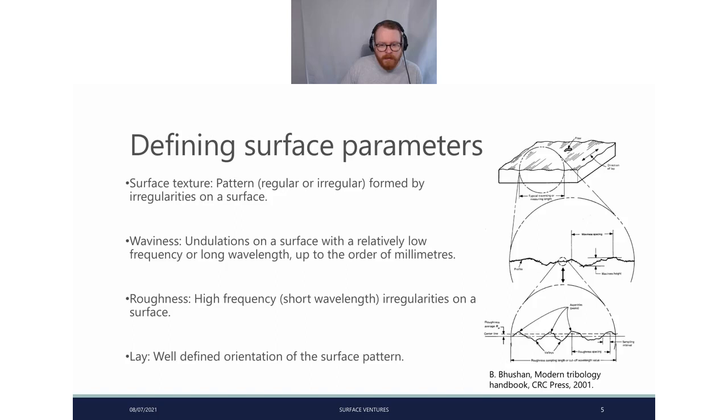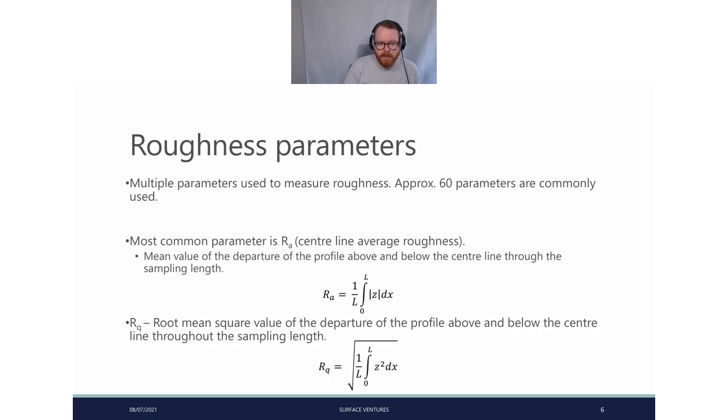So this is very much where we can get to. If you have the correct instrumentation, you can continue zooming in and seeing some of this fractality. And you can see this somewhat in this diagram here. Going to various roughness parameters.